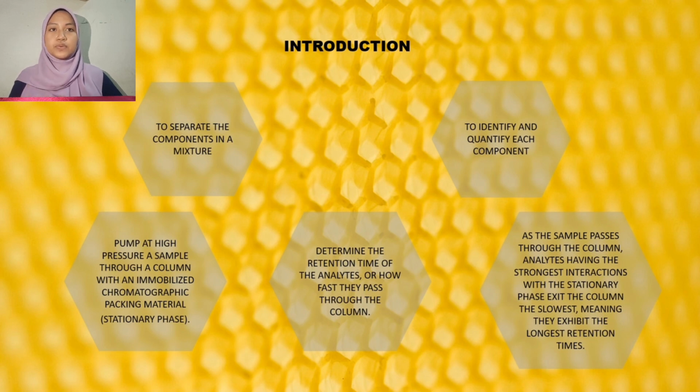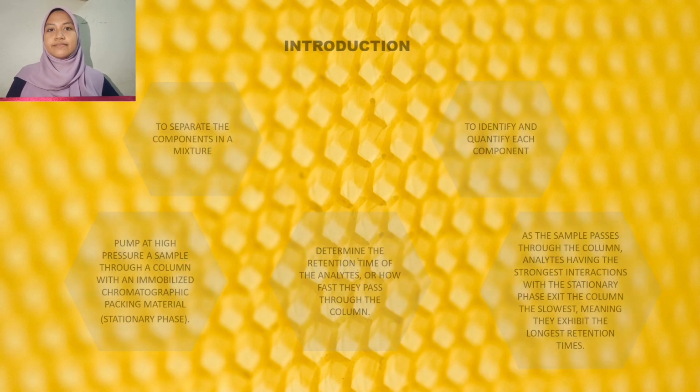As the sample passes through the column, analytes having the strongest interaction with the stationary phase exit the column the slowest, meaning they exhibit the longest retention times.